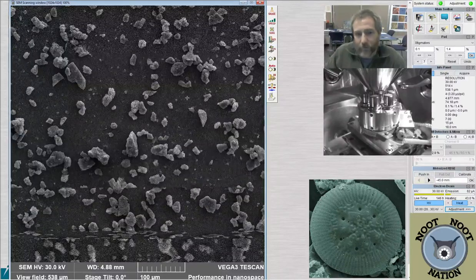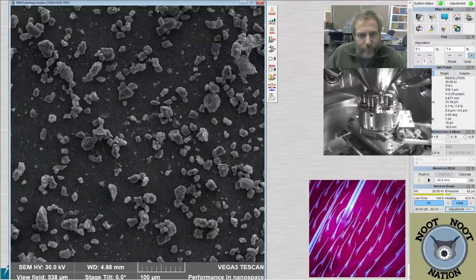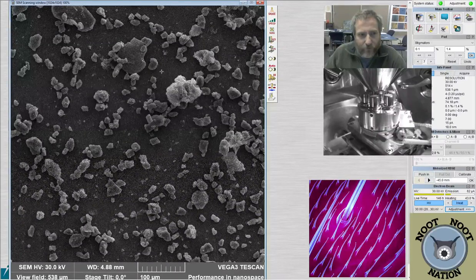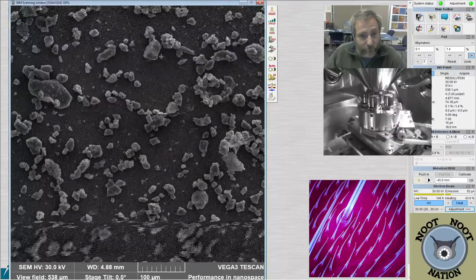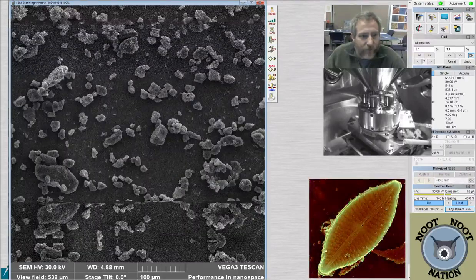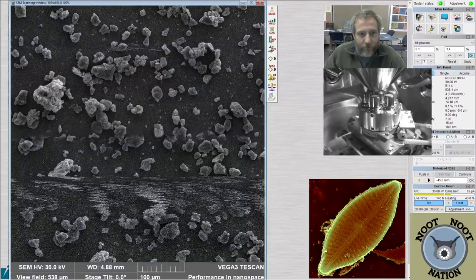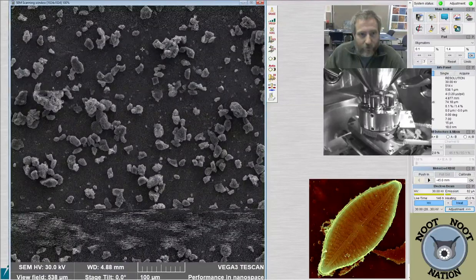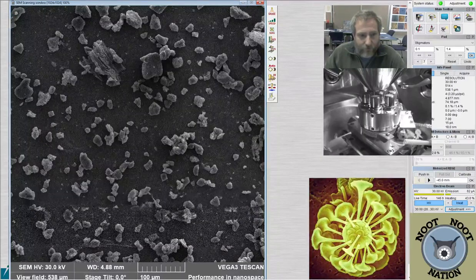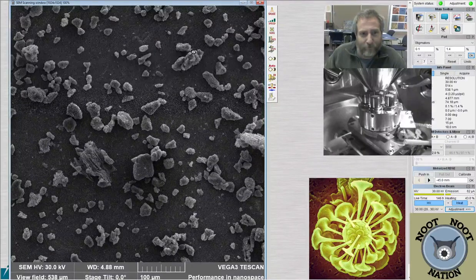Not seeing a ton of diatoms in this sample. So hopefully we'll get at least one more good view of something. And I can start that picture and then we'll find somebody to raid. I would even accept a Nitzschia at this point.